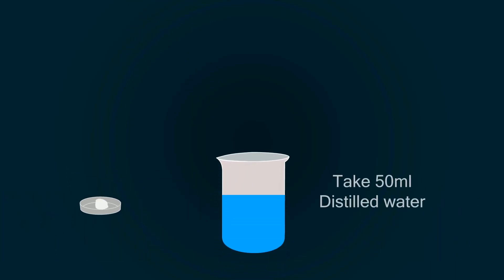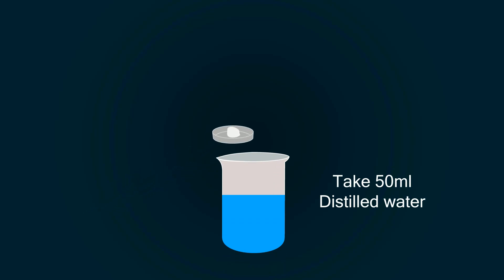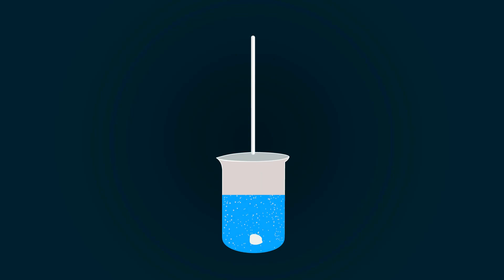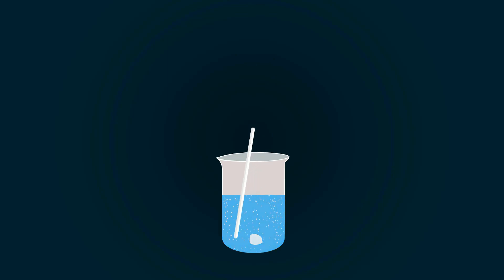Now take some distilled water in a beaker up to 50 milliliters, and put the starch chemical into it. Mix it with the help of spatula to make a homogeneous mixture.